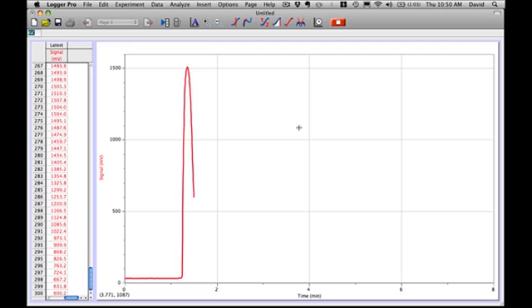And now we will see how good our profile is, because we do have two other substances in our mixture. If we've done everything right, there should be a small gap on the graph between the first peak and the next peak. The graph is showing that our first substance has passed through the column and the detector, and now we are waiting on substance number two.